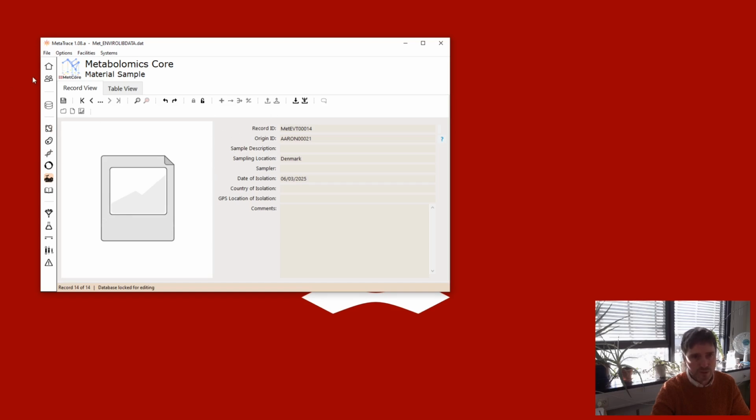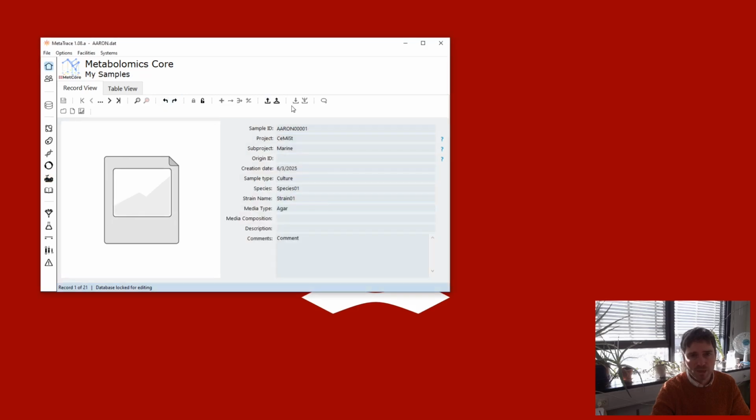So that was one example there. If we go back now, it will ask us to save. Yeah, we can just save. Another one is this here. So this is merging multiple records into one.